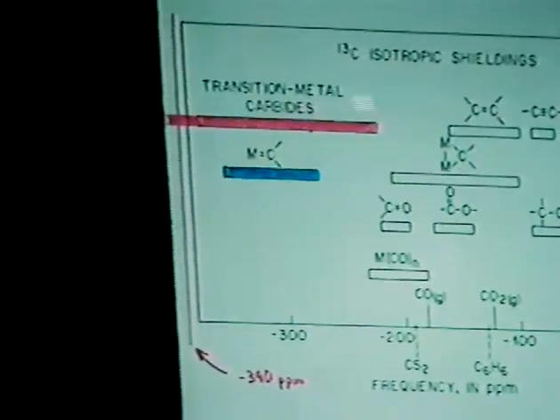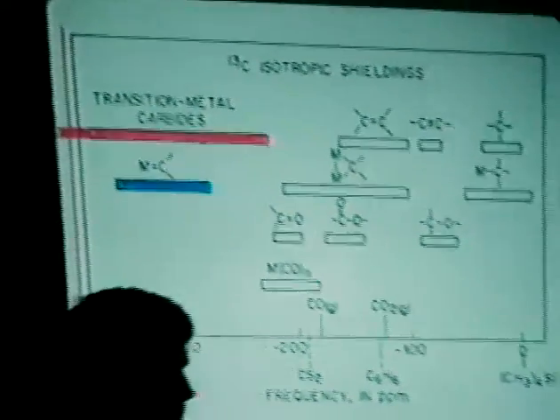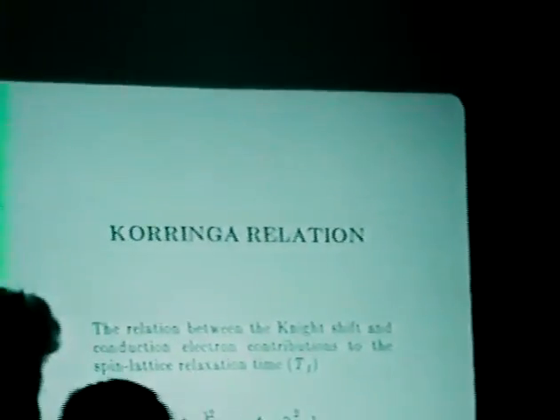What we did was go in and look for dipole couplings to the other species that might be bonded here, carbons, carbon, hydrogen, or whatever, and found no such couplings, thus confirming that it's the carbide species. We have a little bit of time, so I'm going to insert an interlude here of what one can do. If one accepts that analysis, one can now go farther in the interpretation of that peak. And that is, the shift of that line is caused by conduction electrons.